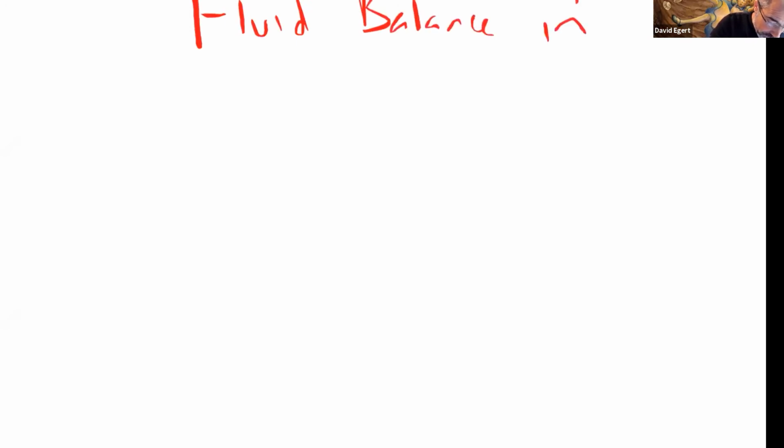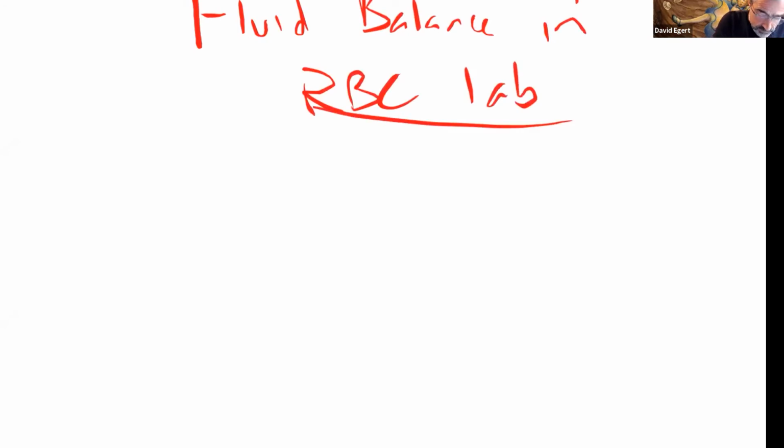The lab that we were going to do today, and I hope you've done the pre-lab, is taking a lot of these concepts and extending them to the real world of our cells, and actually doing it with real cells so you can see what happens. The fluid balance and RBC lab. I am going to talk about tube 1 because I saw some hilarious stuff there.